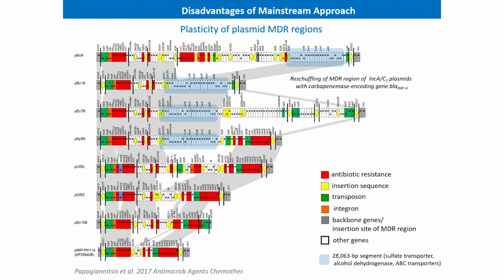So if you say that, for example, we found this plasmid, and we recognized it 3 years ago, and if you map your reads against this one or this one, you will lose a lot of your actual structure of the plasmid. So this is why assembling across a reference is not always a good idea.